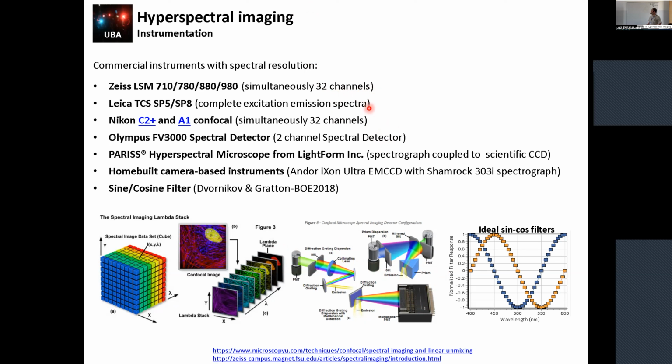The thing is, there are some other solutions for hyperspectral imaging, and one of them is basically the camera. If you have a camera and you project a point in your camera, well, the spectra in your camera, you can collect the intensity in a space in the chip of your camera, and you can assign, if you calibrate, what is the wavelength of each pixel, and you will have really great resolution, on the nanometer scale.